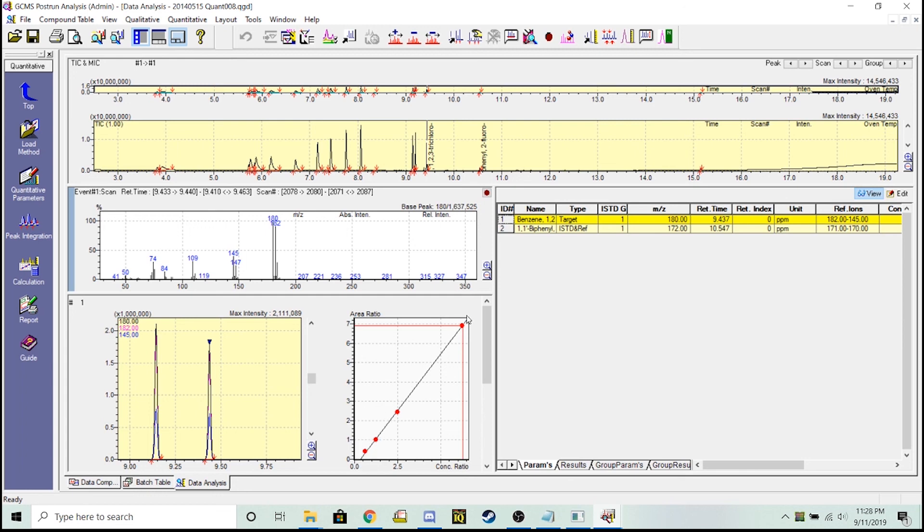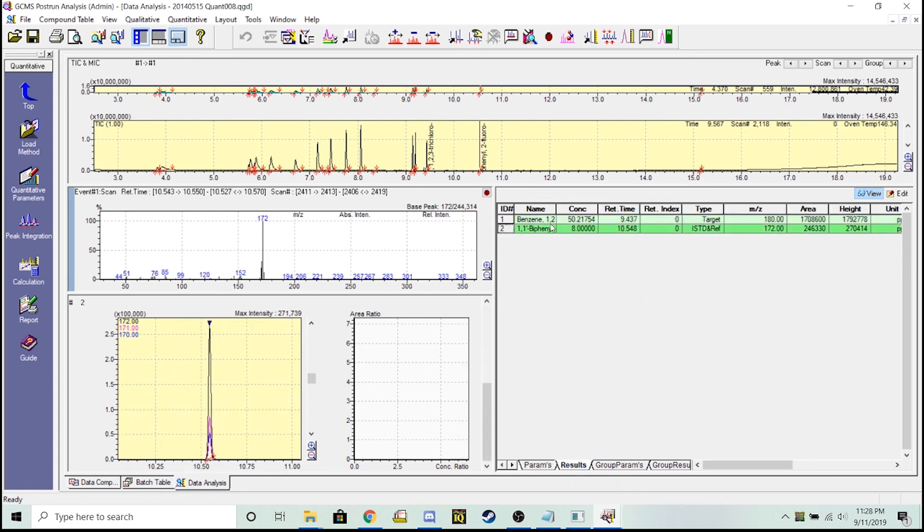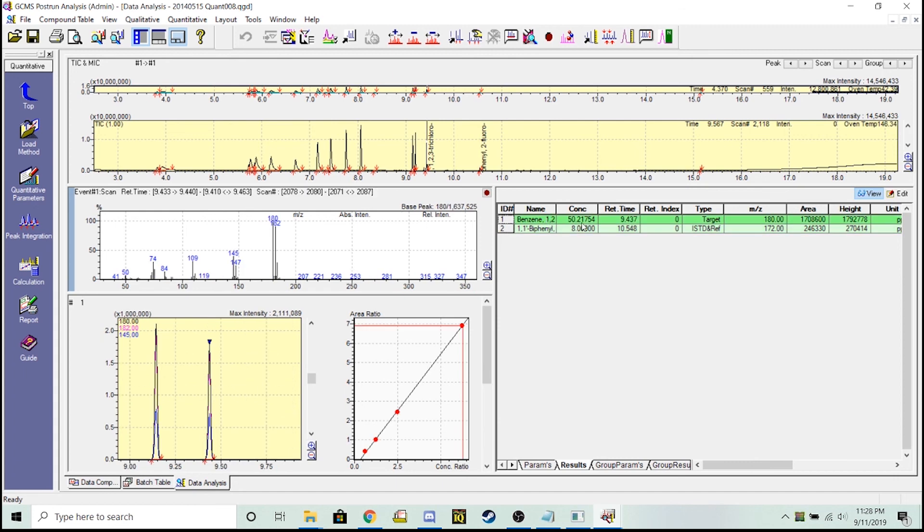So now we'll load this newly created simplified method onto our GCMS for those runs and it can automatically, if I click this results tab, tell me what the concentration of 1,2,3 trichloro is for any data file I run in this results tab. I hope that helped.